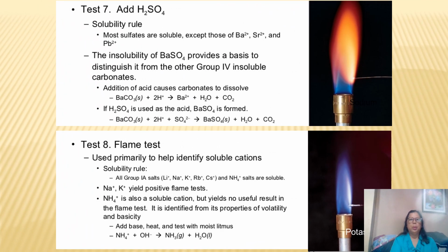When you make some tests, you can see here what precipitate is responsible for the color of the different tests.